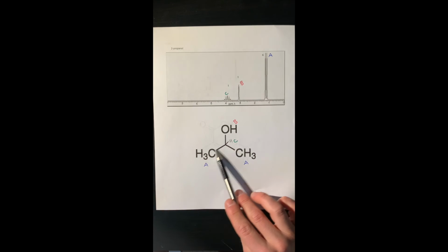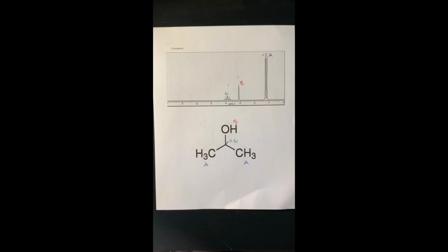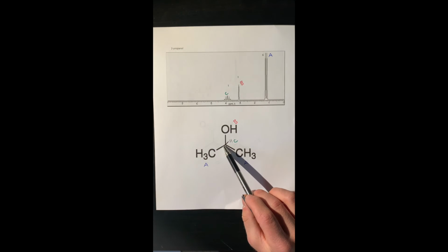So the next proton NMR that we will be looking at belongs to 2-propanol. So 2-propanol has a chemical formula of C3H8O, and once again I have the structure here so that you guys can look at it, and it consists of a carbon right here in the middle with a methyl here, and then up here there's an alcohol attached to it. So basically a 3-carbon propane chain with an alcohol attached at the second position right here.